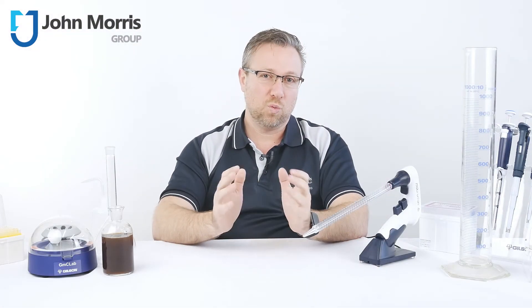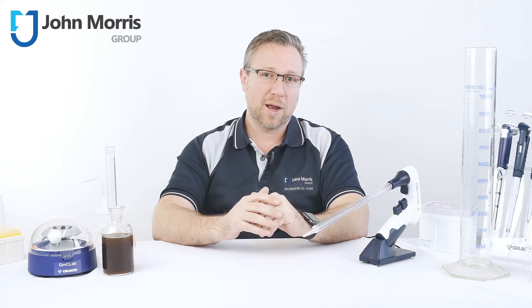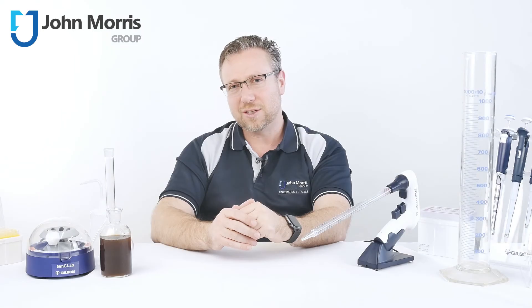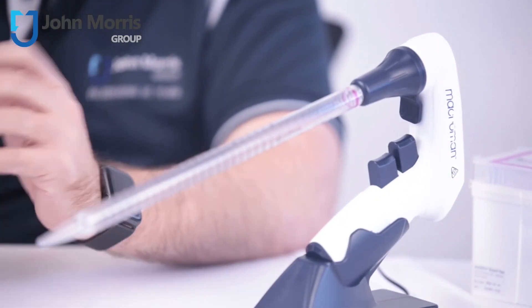There's also an optional wall stand if you like keeping your bench space free and clear, and Gilson also supplies a range of seriological pipettes if you're interested in a complete solution. So that's the reasonably priced Macroman pipette controller from Gilson — precise and easy to use in an ergonomic form factor.